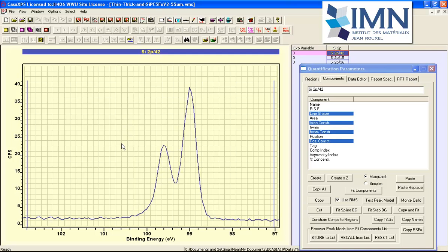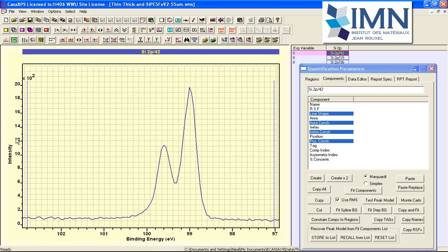So all of these together have produced a pair of peaks that are well resolved, and we've had to collect for a long time to make up for the fact that the sensitivity has been reduced, so the count rate is relatively low, but the intensity is still relatively high enough that the signal to noise is very good.